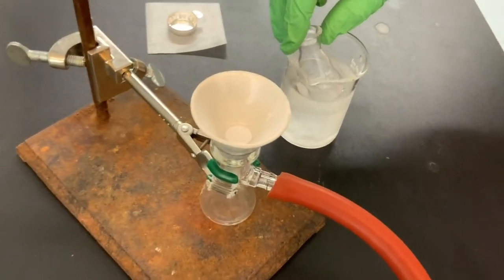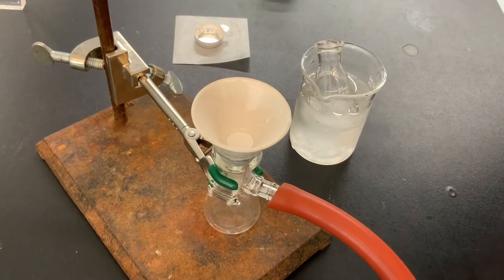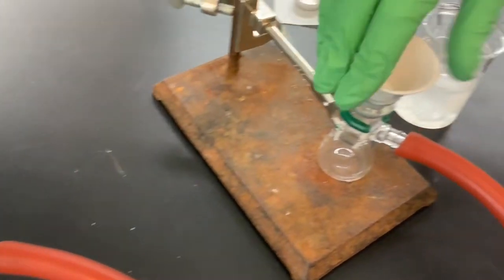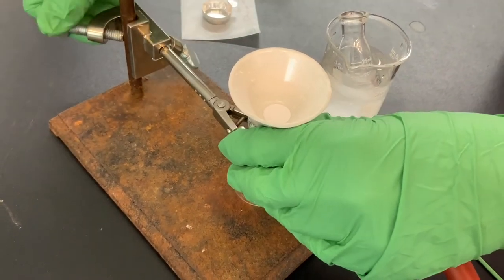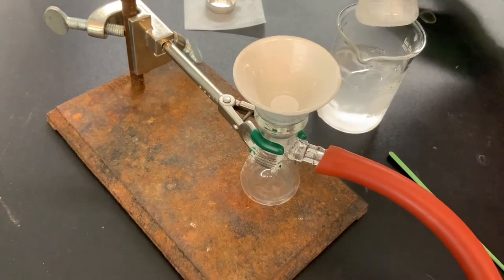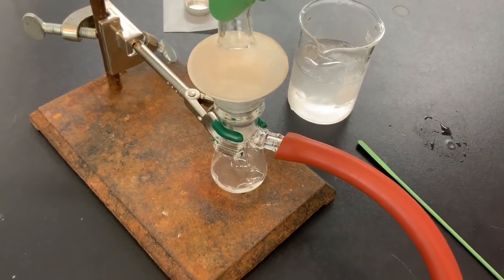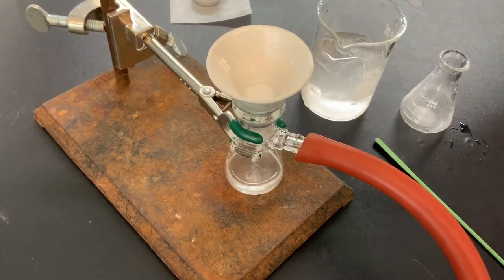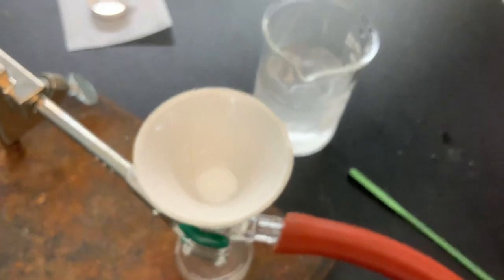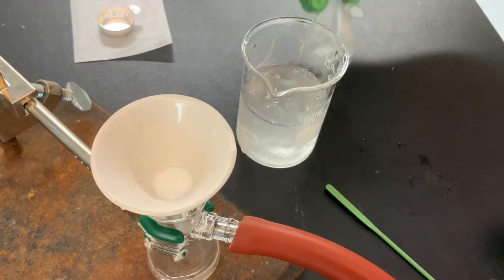All right, so now we've got our benzoic acid in water, in acidic water, and we've chilled it for some time to be sure most of it has precipitated out. We've got our Hirsch funnel with this rubber collar connected to the sidearm filter flask, and I'm now going to turn on the vacuum. All right, so we're ready to go. So I'm going to swirl it to try and get all the solid to come out at once. And now we see that there's the benzoic acid. And there's some residue, right?